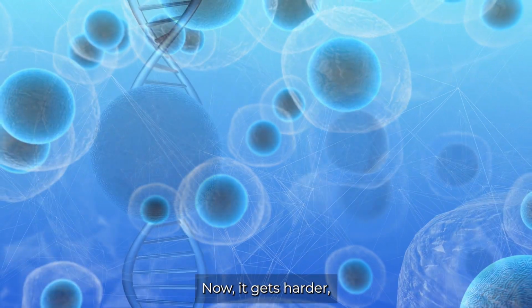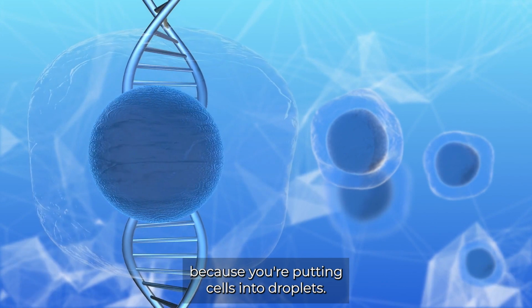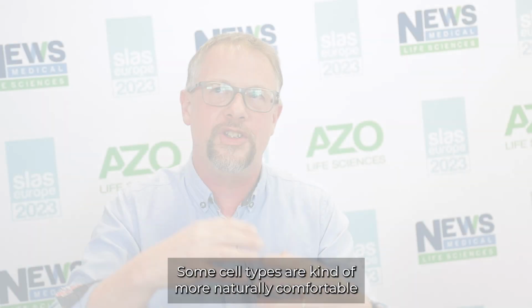Now, it gets harder because you're putting cells into droplets. Some cell types are more naturally comfortable in that environment than others. So there's a lot of work to do, but you can certainly see how the underlying technology could be applied to many areas which are maybe more research today, but certainly in the next 5, 10, 15 years will be coming to market and becoming genuine products and capabilities.